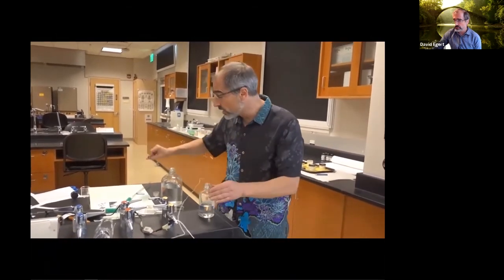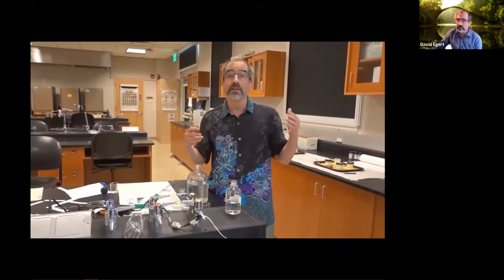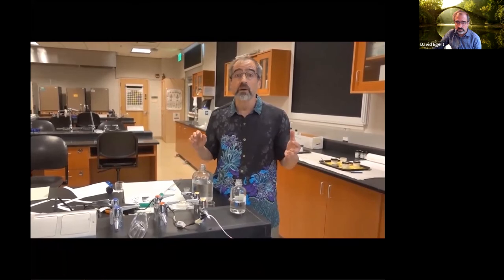And that's more data I'd be recording in my lab notebook. A little later on, I'll be spending more time interpreting what it all means. But the first step, while you're actually getting the data, is just to keep an accurate record of your observations.